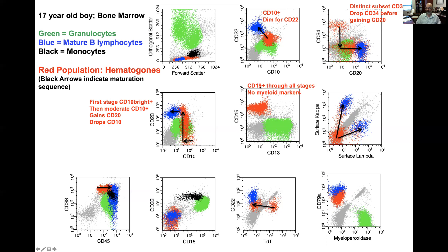CD19 is positive through all stages — it's a pan B cell marker and doesn't have quite the maturation spectrum of CD20. Hematogones are defined by CD19 positivity. They do not express any myeloid markers; these are normal B cells. There are two more myeloid markers in this panel — CD33 and CD15 — and again, hematogones and mature B cells do not express myeloid markers.